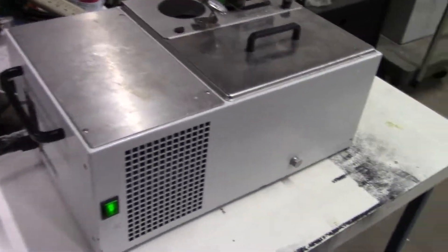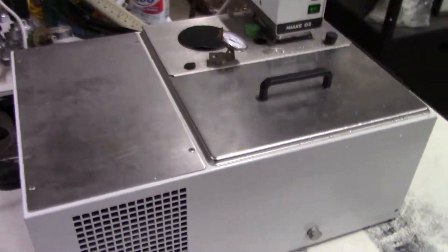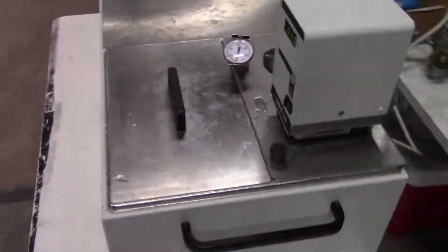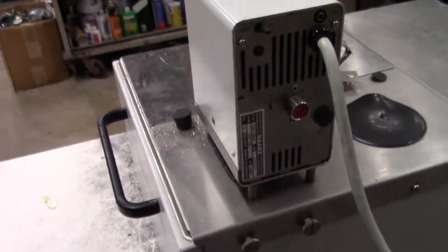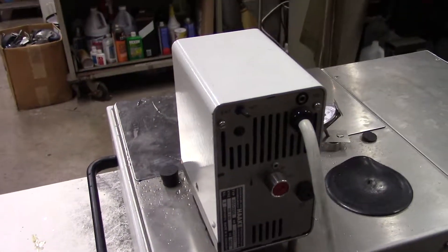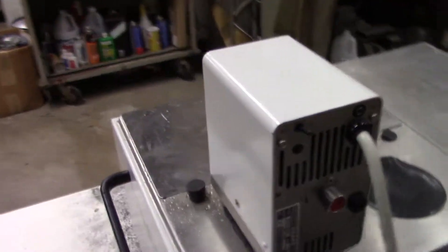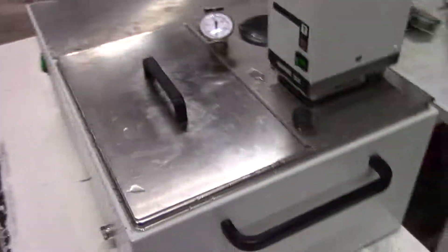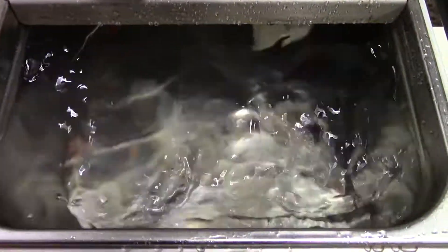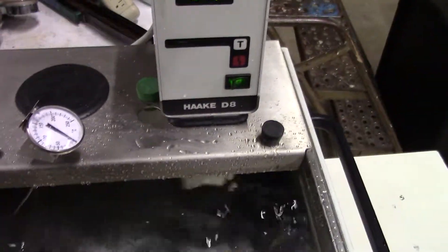Hi, this is Michael from Hi-Tech Trader. Today we're looking at a Haki. This is not a recirculating chiller in the sense that it has two outlets in the back. It is internally recirculating, keeping the water at a very constant temperature with the Haki D8 controller.